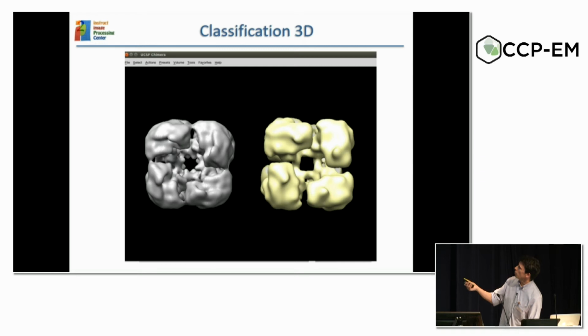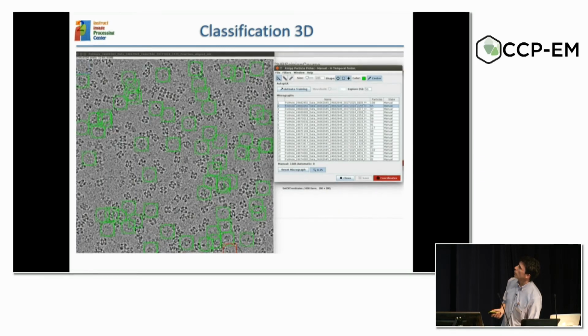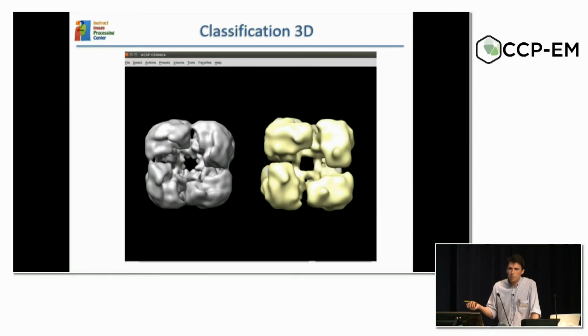If you take the particles associated to this structure and go back to the micrographs, you see there are empty particles, broken particles, very bad things. So this is an example of the Einstein from noise. So you have started with a structure, you have given some data set, and it will try to split the data in some way, but it doesn't mean that the split is correct.